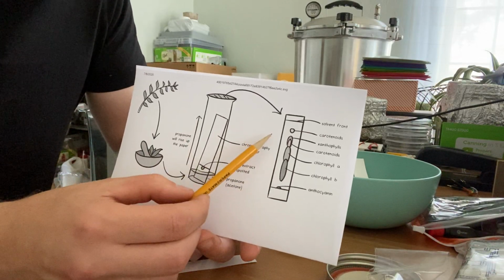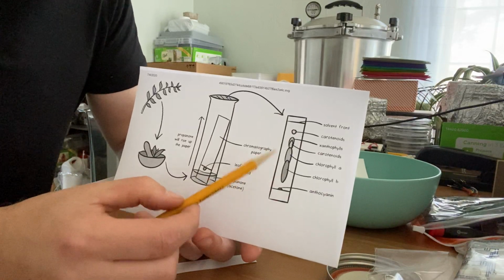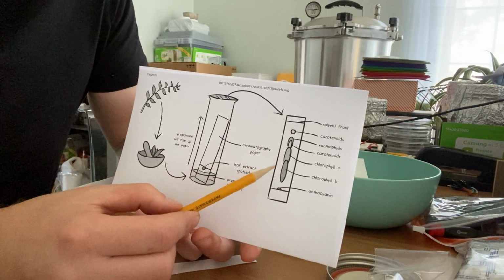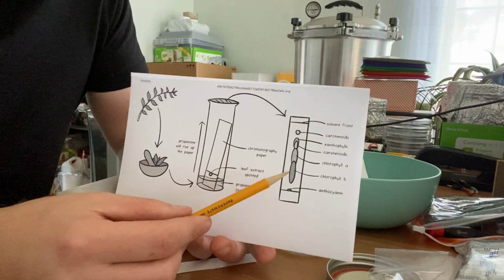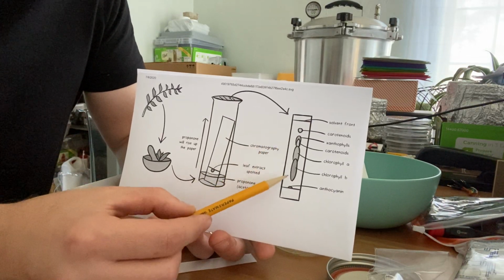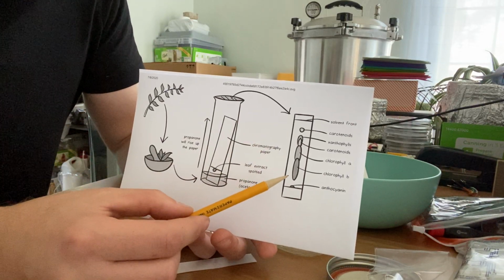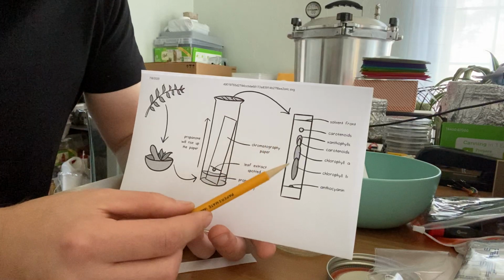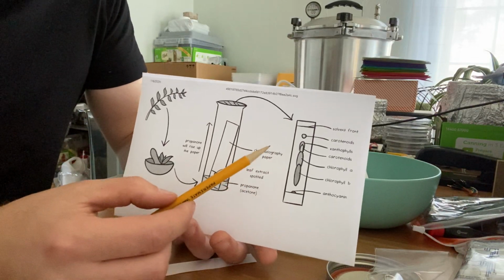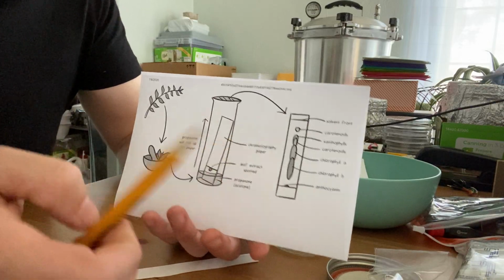And this is known for most compounds, most organic compounds. So cordycepin or terpenes or even psilocybin have published values where you could use TLC to detect their presence, and then eventually we're working on a way to actually quantify that. So let's go ahead and do that. This is basically going to be recreating this experiment here right now.